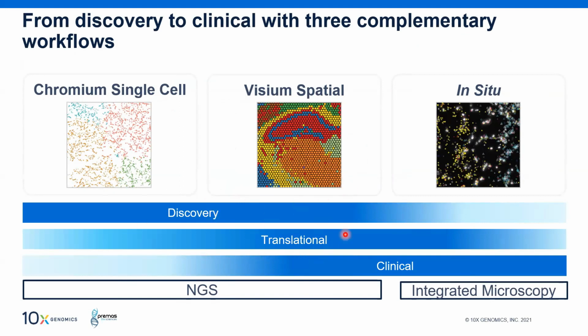People are using it. Now, a new technology is coming: in situ sequencing. In situ sequencing is going to be integrated microscopy based data generation, where multiple data from the same tissue sample can be generated. The first two technologies are based on NGS based data generation, and this will be an independent technology that is going to generate the data directly from the tissue section using an in situ based sequencing method.